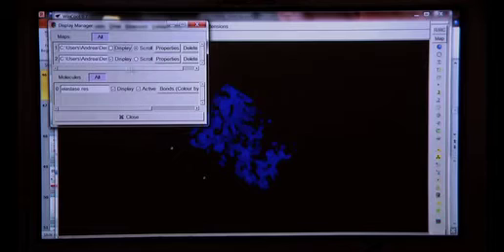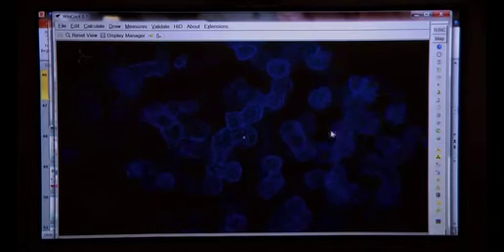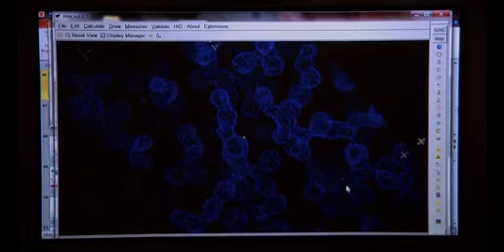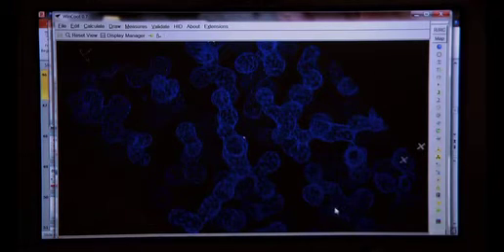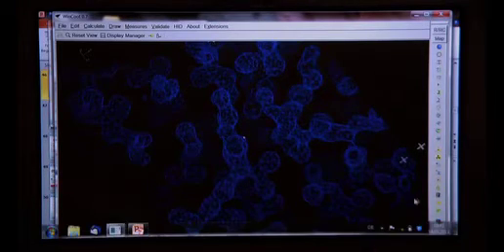The other map looks like this, and you would think that is a protein. It has higher connectivity. We can see side chains already. What is the resolution? 1 point something. You will not see it in your slide. I just wanted to choose an example, but it's very clear what I mean.